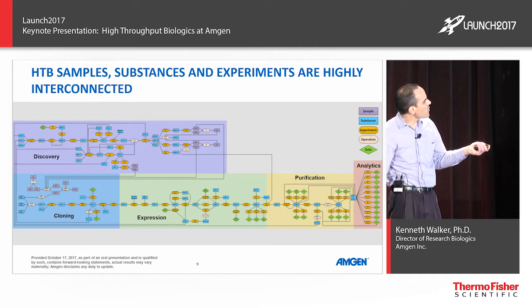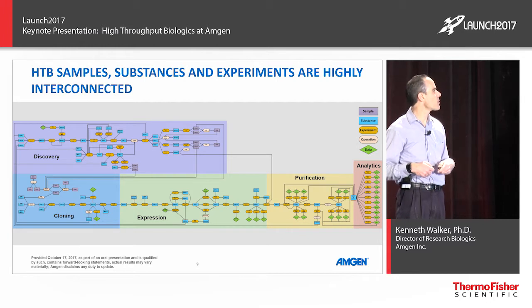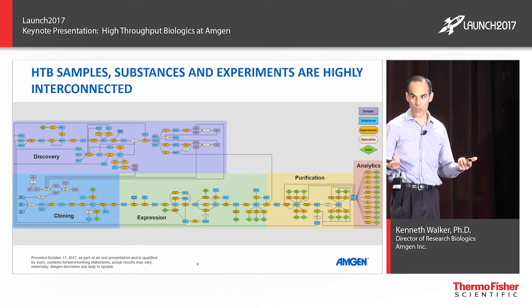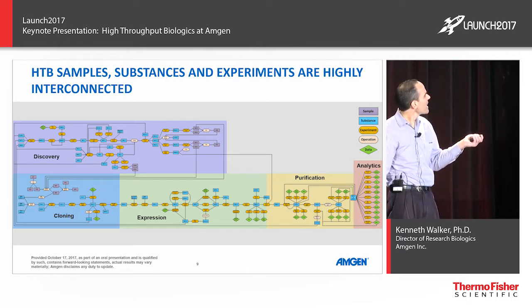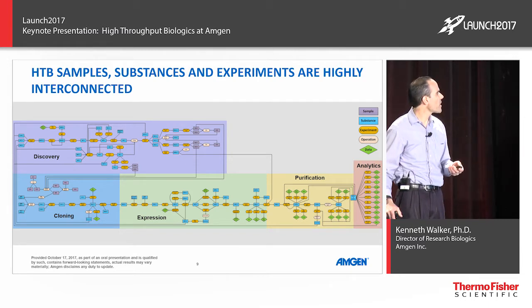They then move into the next stage, which is purification of the molecule. This is another example where you have cyclic processes occurring here. You keep running it through different processes until you get your protein pure enough. Often you're having to do analytics on the side to see where you're at. In the end, you might do your final basic analytics, and then you hand it off for the advanced analytics. And you can see there's a whole suite of different things you can look at for a particular protein product. So that was the simple process, essentially in the early days, which has now been codified by this LIMS system. Thing to keep in mind is that each one of these dots actually defines a fairly complex experiment and has quite a bit of defined data associated with it to define that transformation.